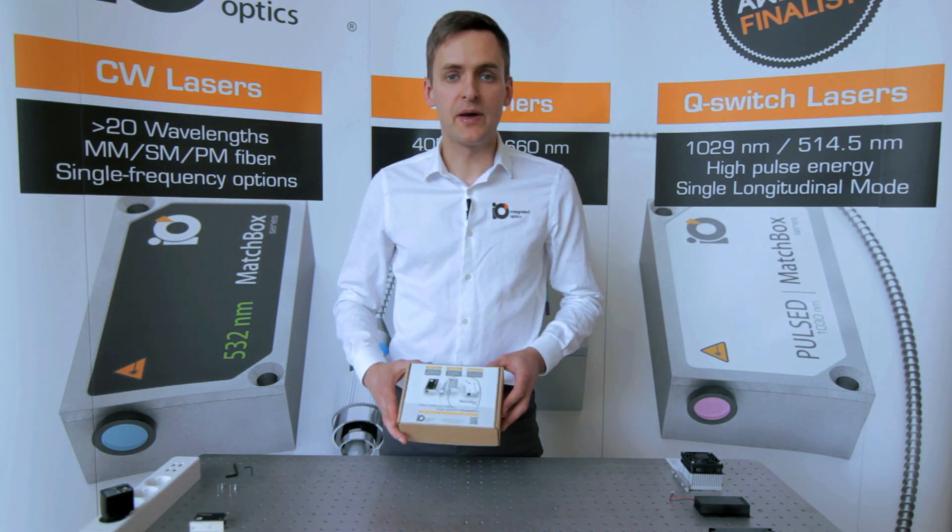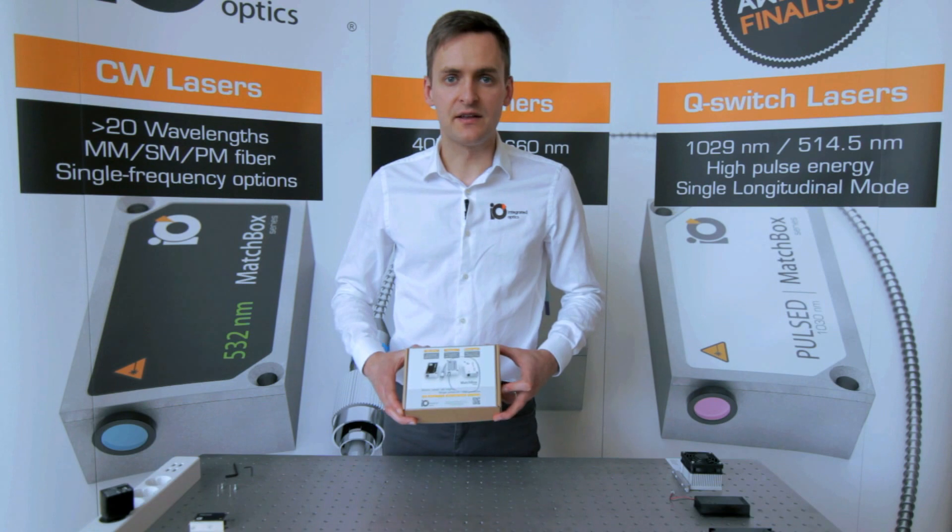Optionally, our RS232 communication interface can be chosen. Lasers are all powered by 5V power supplies or batteries, regardless of wavelength or output power. Let's see how we can unpack and plug in the laser in less than a minute.